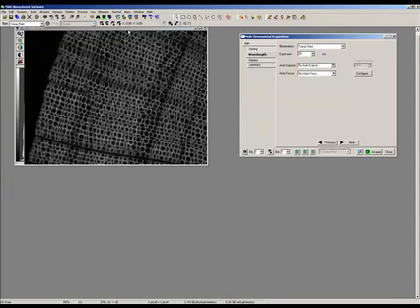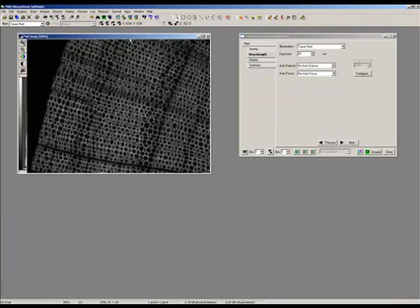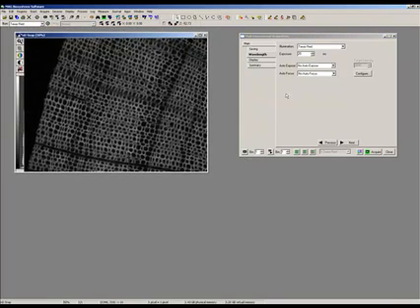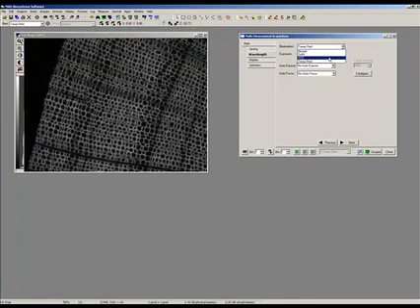I pressed it quite a few times there, but every time I press that button, I actually take a new image. So if I change it, let's just put it on to FITC, and maybe let's use a much lower exposure time, 10 milliseconds, and press snap.